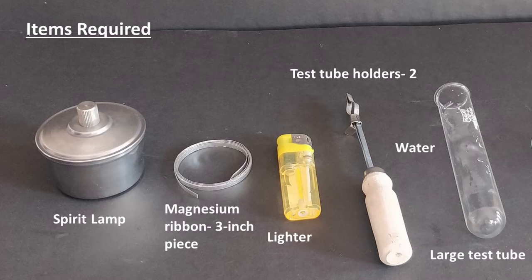Alternatively, you can use a clamp stand to hold the large test tube. You will also need water to fill the test tube up to one-fourth full.